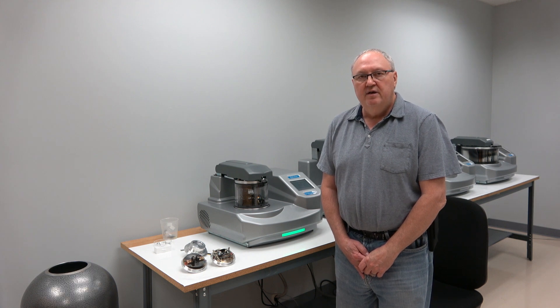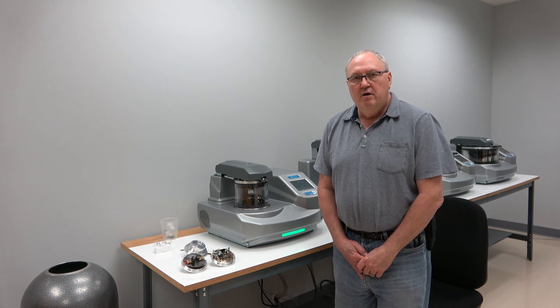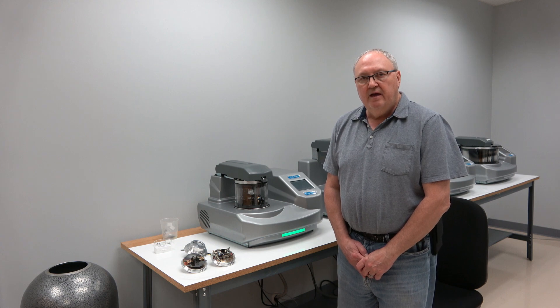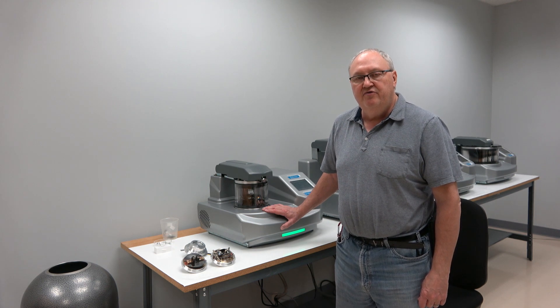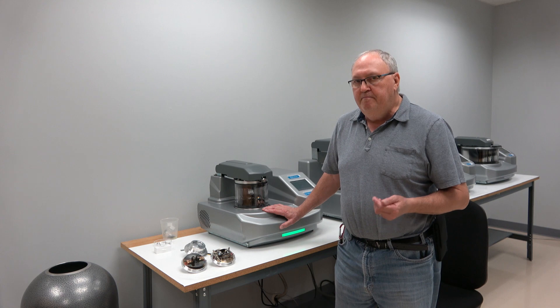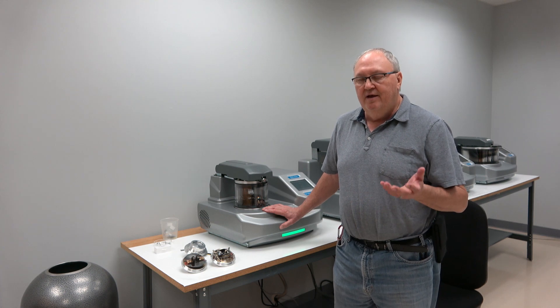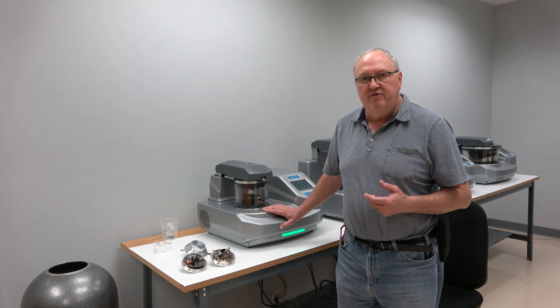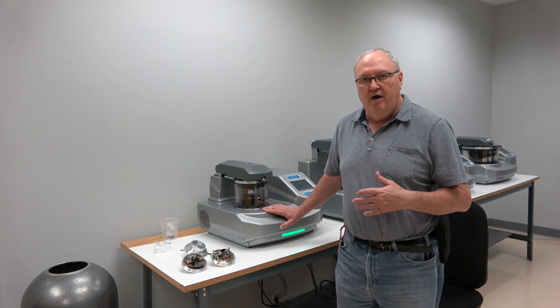Hello, I'm Al Karitz. Today I'd like to give you a brief overview of our EMS Quorum Q-Series benchtop coating tools. I'm going to use the QVS Plus as a template for this overview. They're all basically the same, but the vacuum capabilities as well as whether they can evaporate or sputter or both is entirely dependent on what you need for your application and also fits your budget.